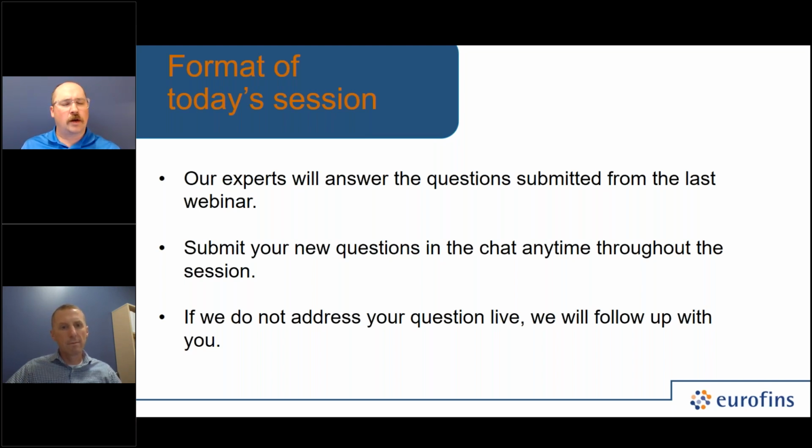The way that we measure postbiotics, and the way that we're going to be demonstrating and providing information on a label to use as a dosage format for a particular health claim, is still up for discussion. I think there's work that needs to be done in the industry to come to a consensus as to the best way forward. I think flow cytometry does have, as I mentioned, some benefits there, but only for a particular subset of postbiotics.